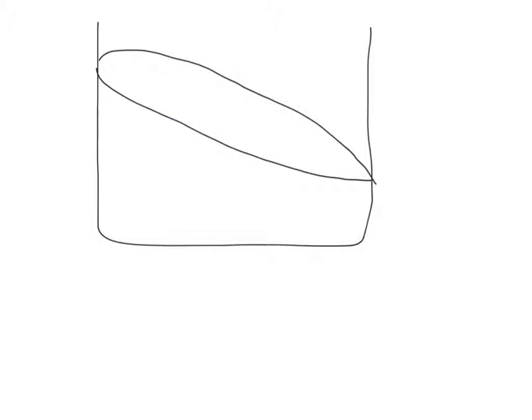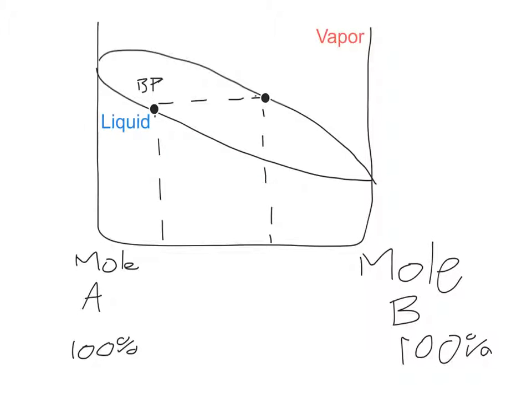There is a limit to the purity of the distillate because even though the mixture will boil during the liquid phase at one specific point, it will also reach the boiling point at a vapor phase when it is pure to a certain extent for the mole ratio. Even with fractional distillation performing multiple simple distillations, which would go from the liquid phase to the vapor phase, making it purer and purer, there is a limit that it will reach.